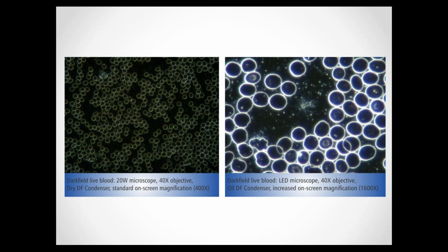And over the years, I've seen consistently great results with live blood analysis in my practice. So, I have no doubt of its ability to highlight the most important issues in a case. For me, the two main reasons why some practitioners may not see the results they expect with live blood analysis is firstly their level of training. If they're not familiar with all the potential anomalies and what they could mean, then they won't be able to use live blood analysis properly.